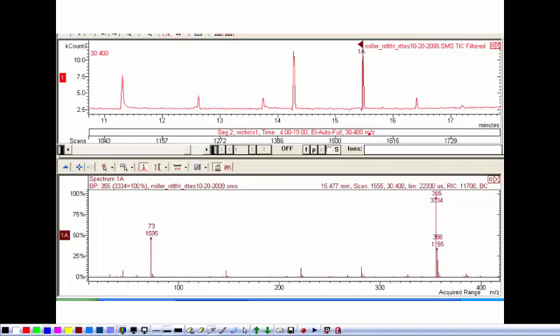And she got all these little peaks in her GC, but when we looked at them, and where the little flag is in this mass spectrum, we got a compound that had all these isotope peaks after it, which means it was a silicon compound, which wasn't in the beer. It was coming off of the column, because as the column heats up and cools down, it degrades and shoots silicon compounds out. Plus we have a little rubber septum that the syringe goes through that is also made of silicon, and so those degrade over time. So in the end, all the peaks that were on top except one turned out to be not from the beer. It turned out to be from the column.